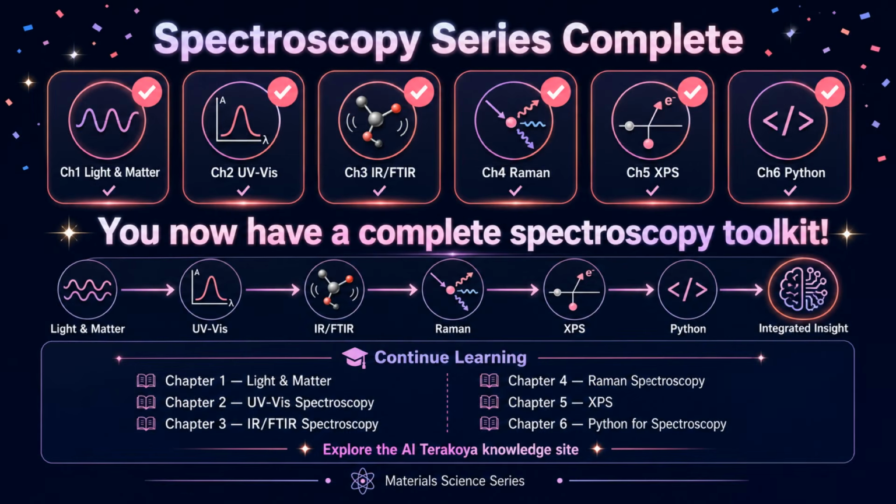Congratulations on completing the Introduction to Spectroscopy series. You now have a comprehensive toolkit spanning 6 chapters. Chapter 1 covered light matter interactions, Chapter 2 UV-vis absorption spectroscopy, Chapter 3 infrared and FTIR techniques, Chapter 4 Raman scattering, Chapter 5 XPS surface analysis, and Chapter 6 Python automation. You can now combine these techniques in integrated workflows for complete material characterization. Revisit the code examples in each chapter and the reference textbooks listed there to continue developing your spectroscopy expertise.